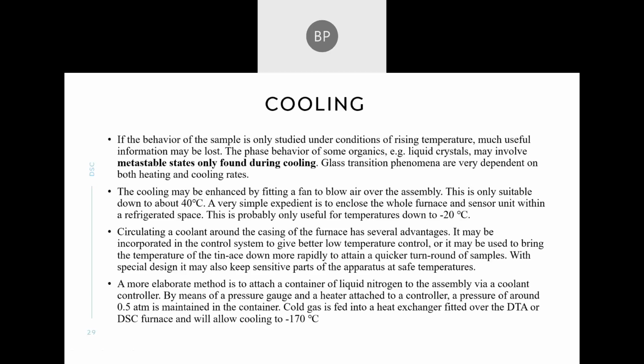The most widely used coolant is liquid nitrogen, because it is mostly available and very cheap, and also comparatively it has a higher CP value.